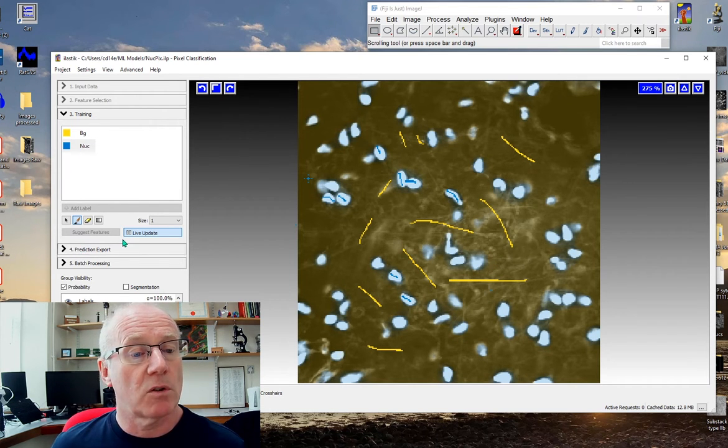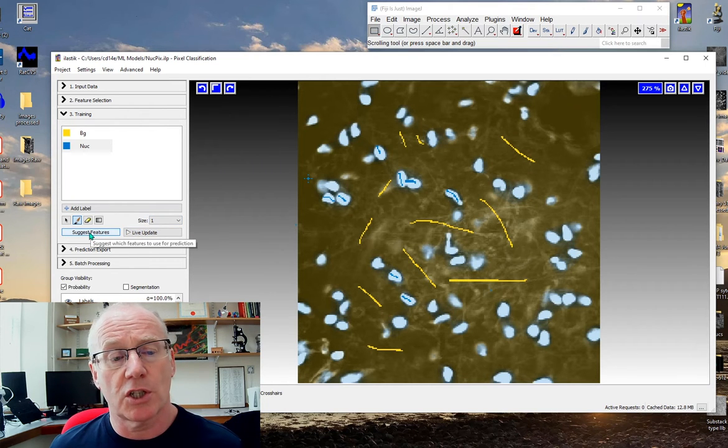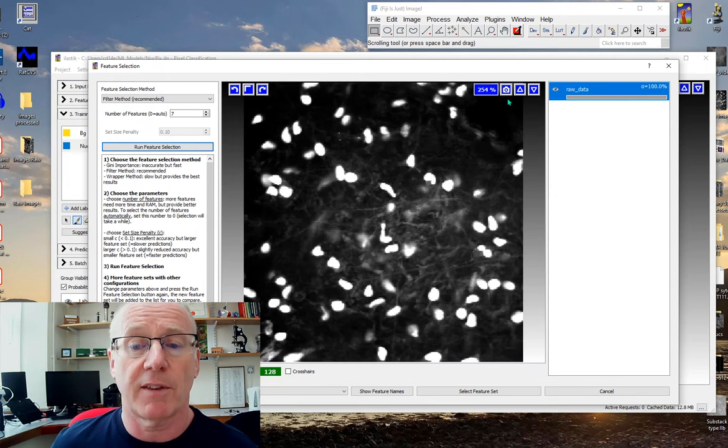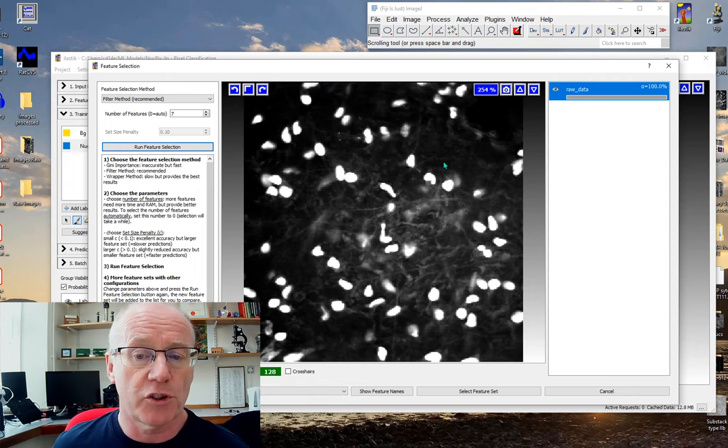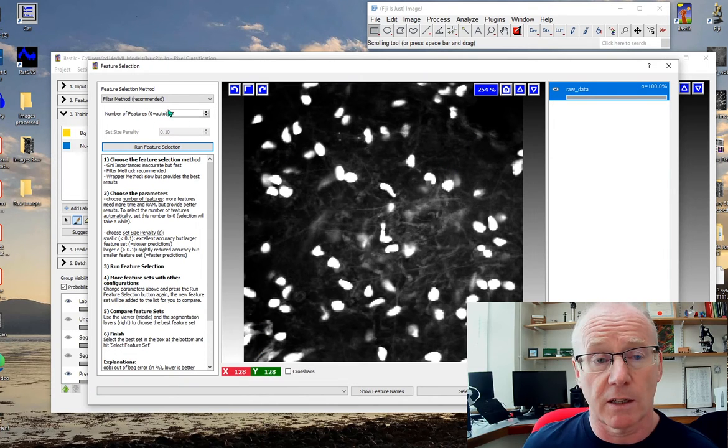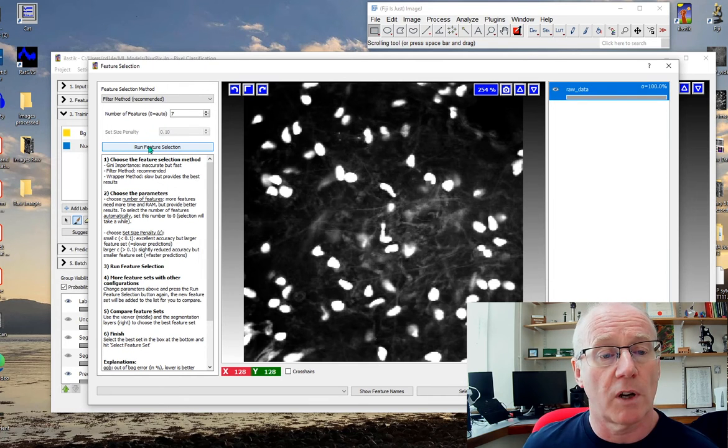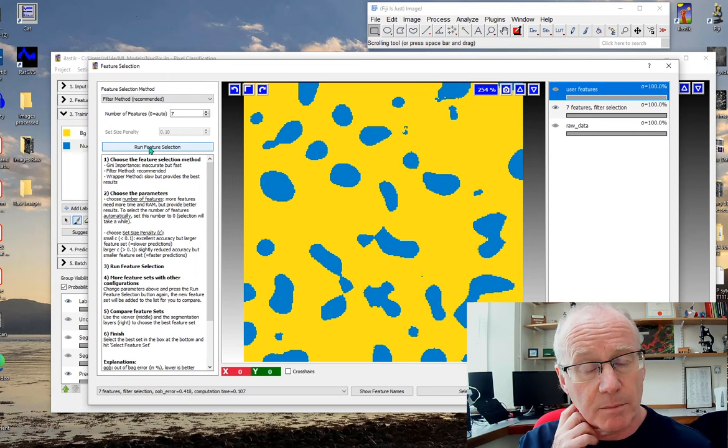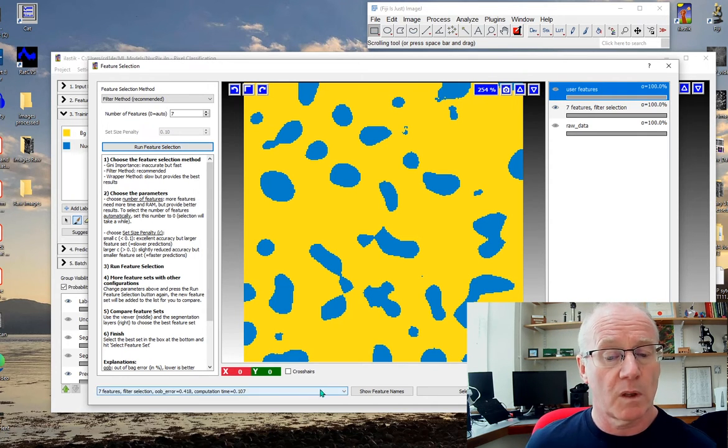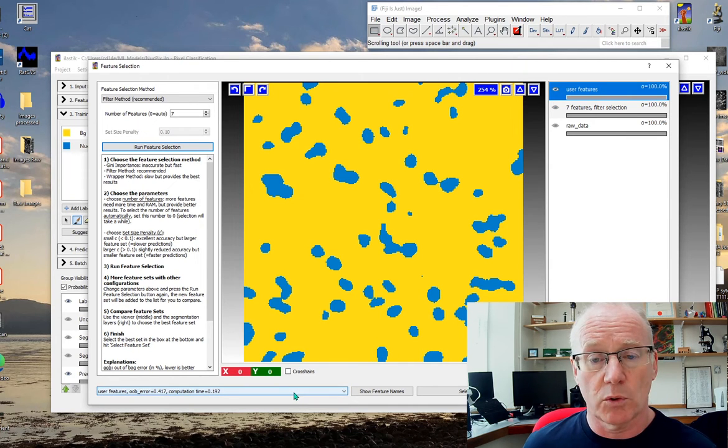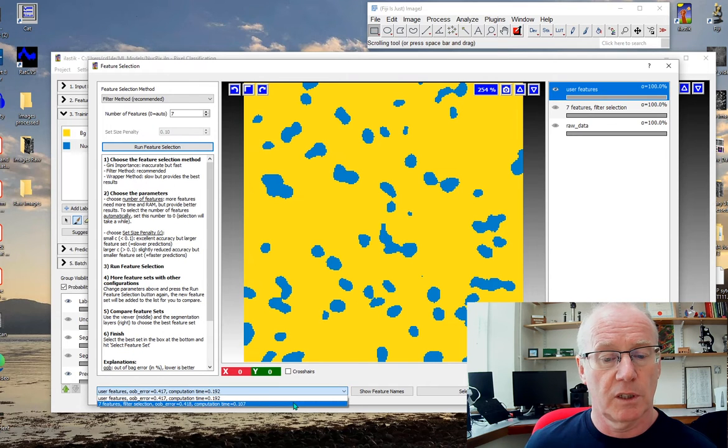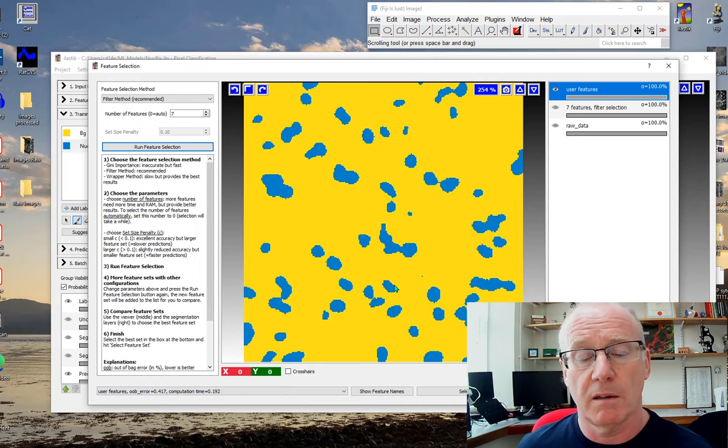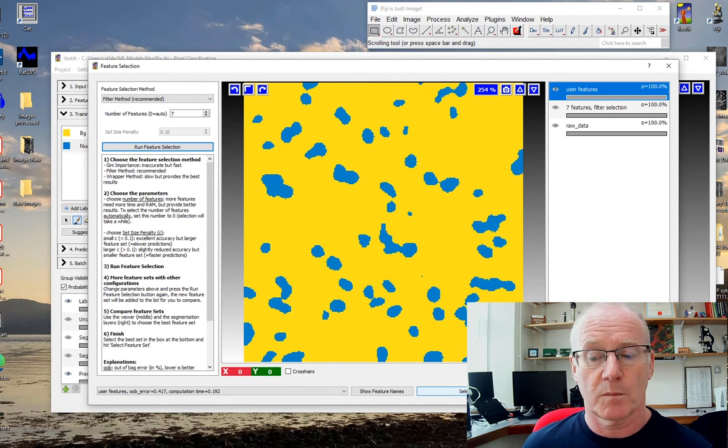Let's take the live update off and look at the suggested features. Ilastik will suggest some features that it thinks are probably sufficient to train the network. It's selecting just seven features here, but here are the ones I've chosen which are all of the features. I'm going to stick with my user selected feature set.